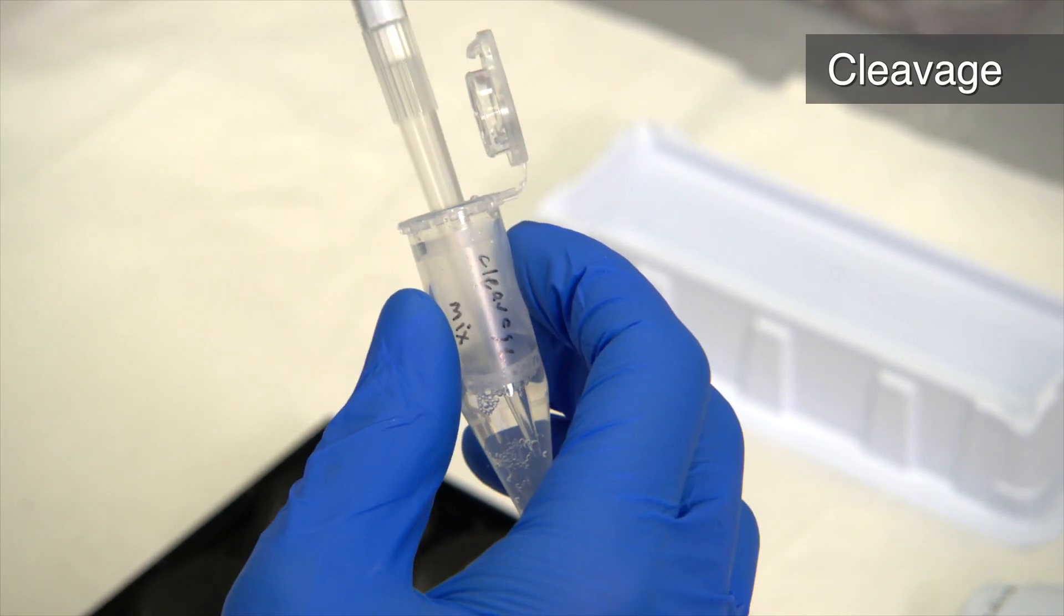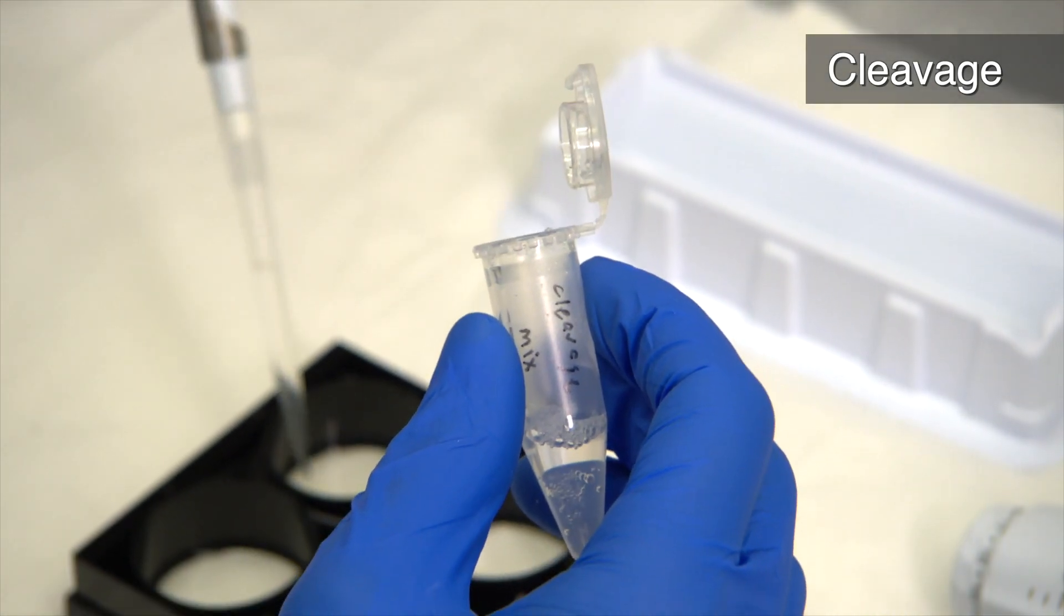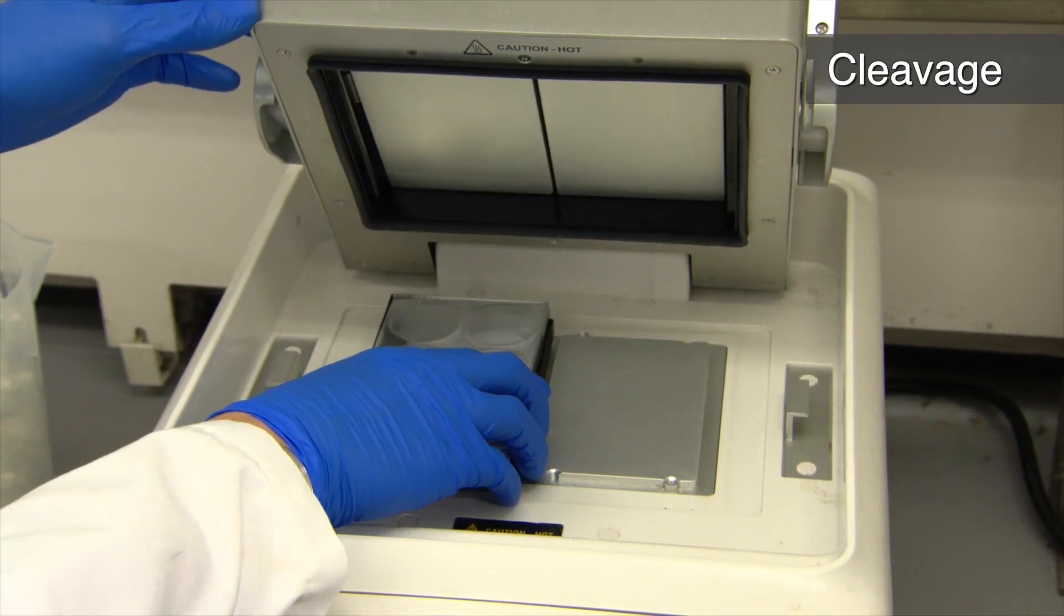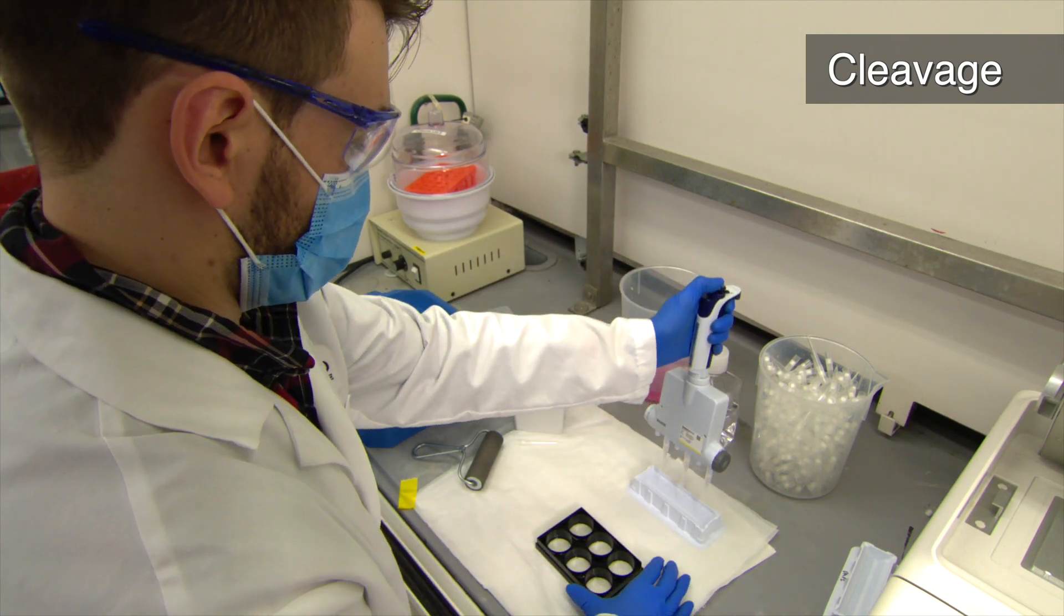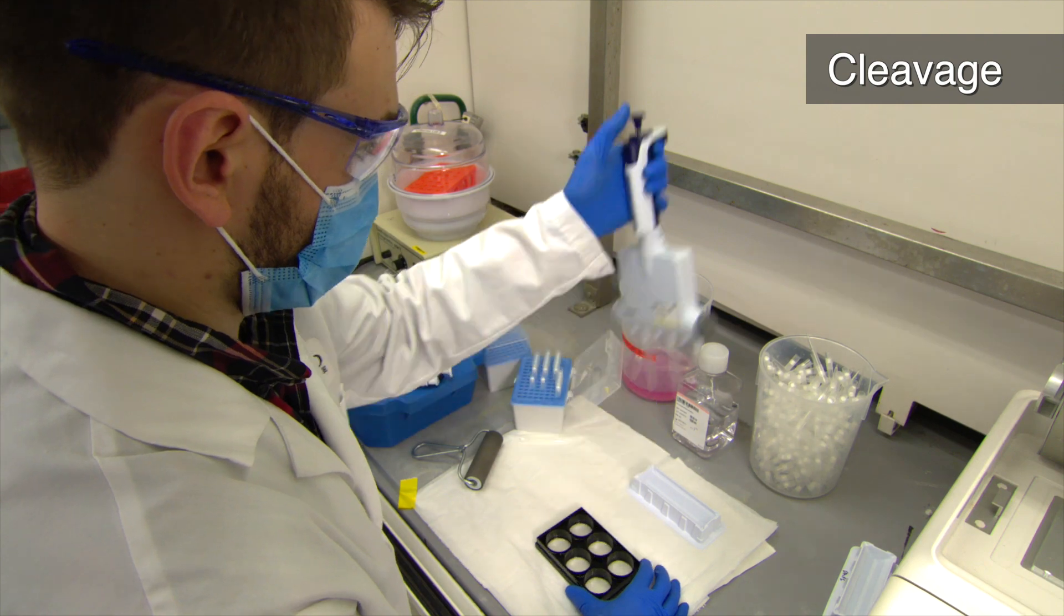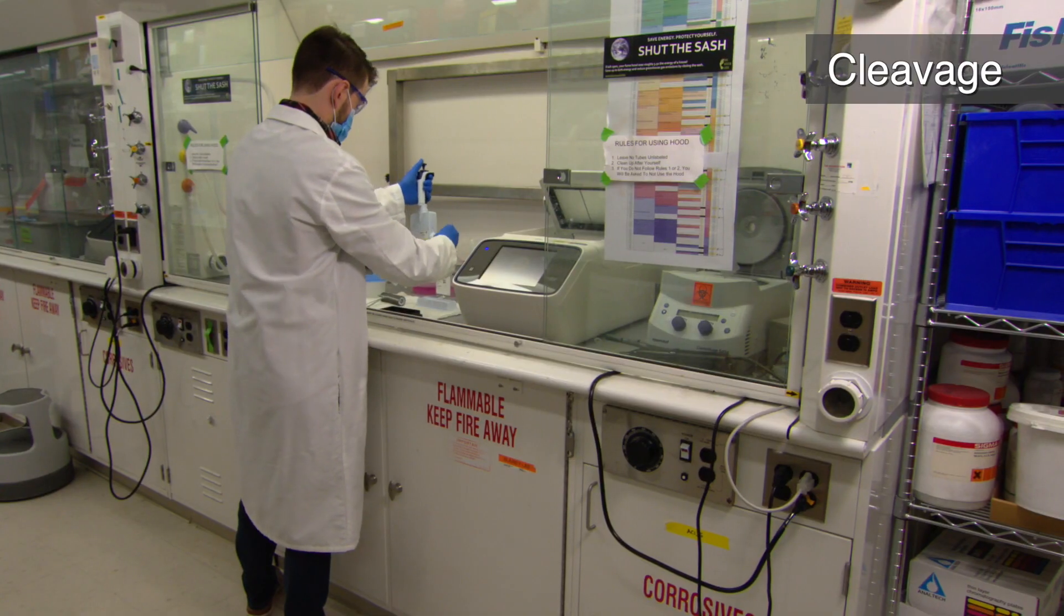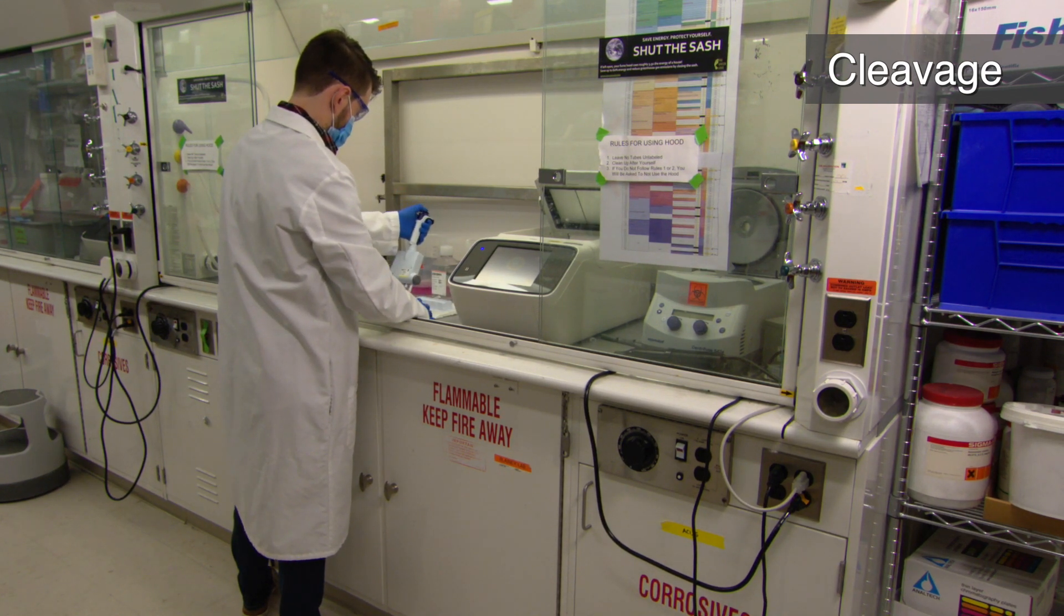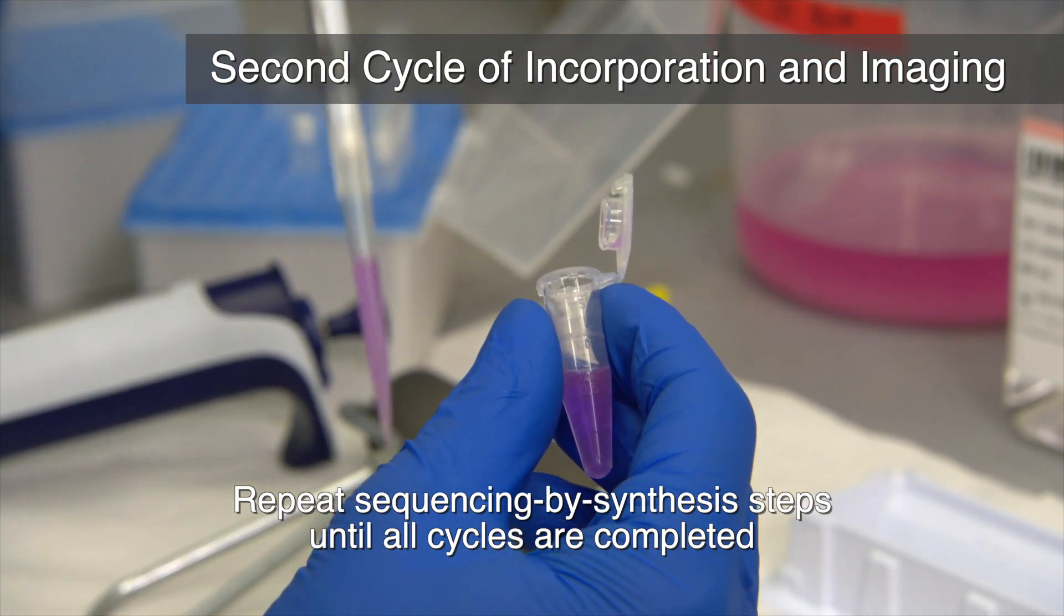Next, prepare the sample for the second cycle of sequencing. First, exchange DAPI for 500 microliters of Illumina cleavage mix and incubate at 60C for 6 minutes. Wash 3 times with 1 milliliter PR-2 at room temperature. Then, wash 3 times with 1 milliliter PR-2 at 60C for 1 minute each. Do 3 additional washes with 1 milliliter PR-2 at room temperature for 1 minute each. Finally, incorporate the next nucleotide position as before and image.